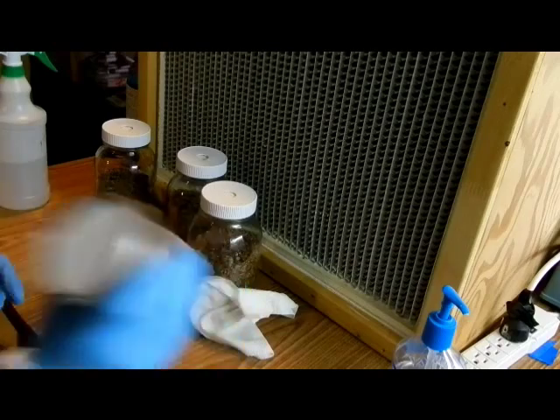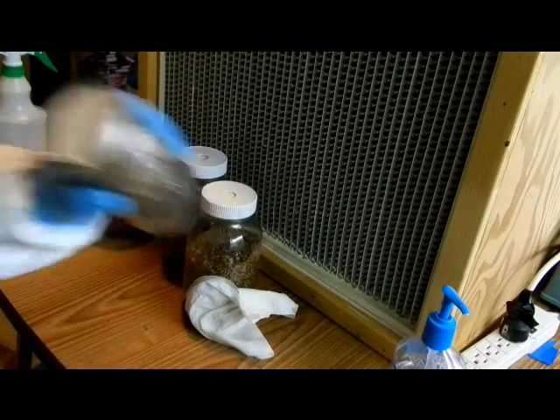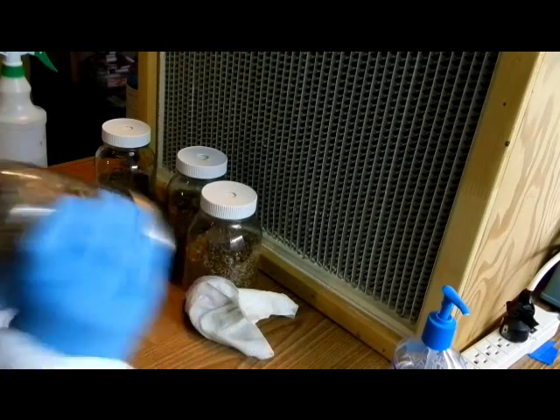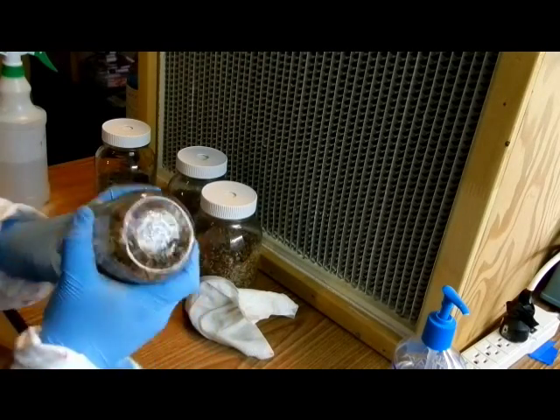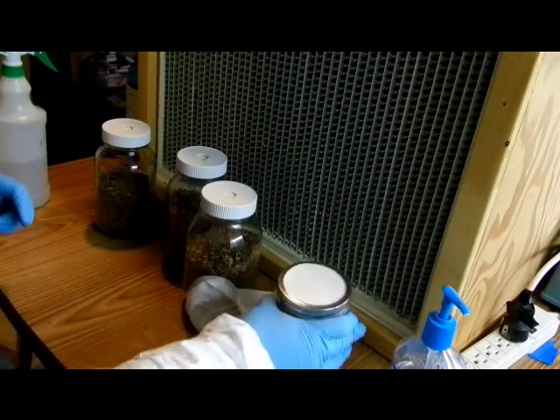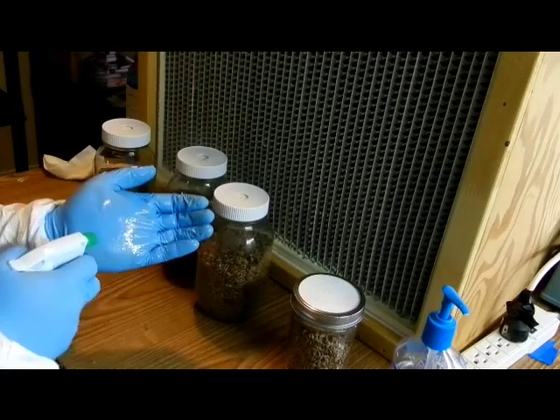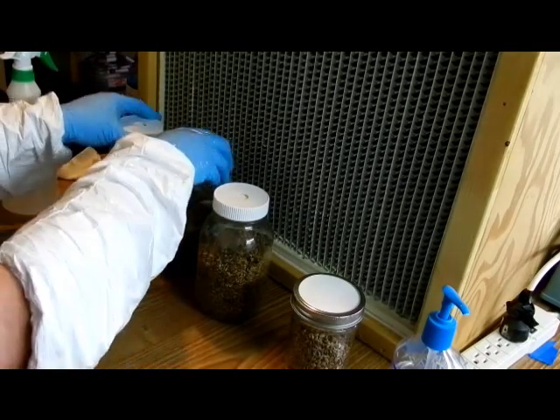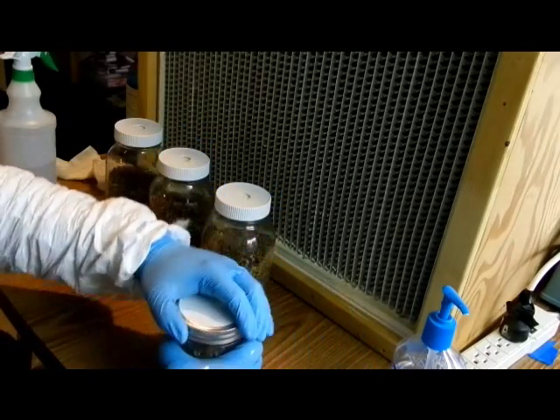Here's my donor jar. I've wiped it down with rubbing alcohol. I'm just making sure that the kernels are good and dispersed, so that when we do make the transfer, we'll have a good amount of inoculation points. I'm going to give my hands one last spray down with isopropyl alcohol, then rearrange my jars in front of the laminar flow hood.